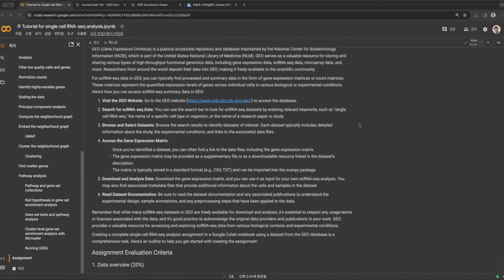I don't think this is the one. I think this is the one. Import.